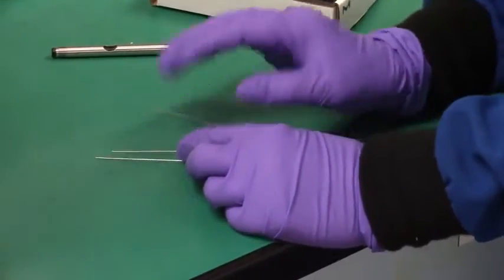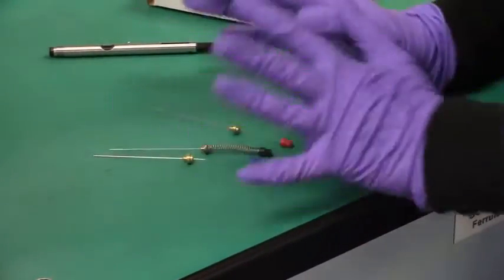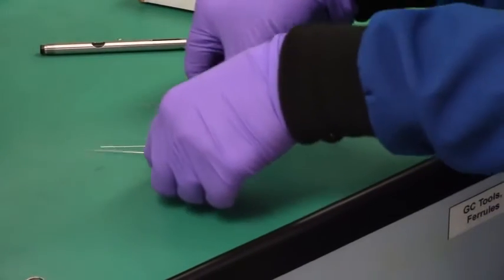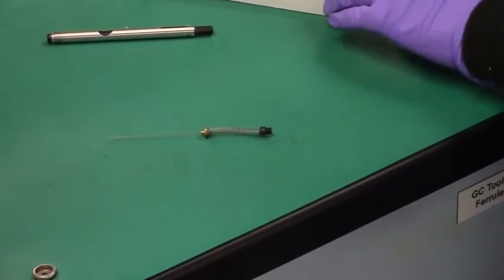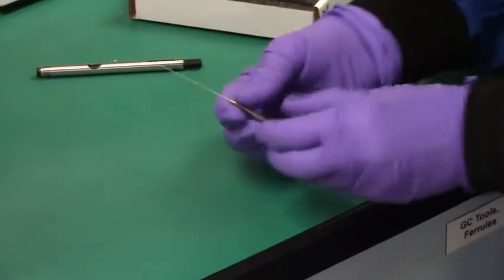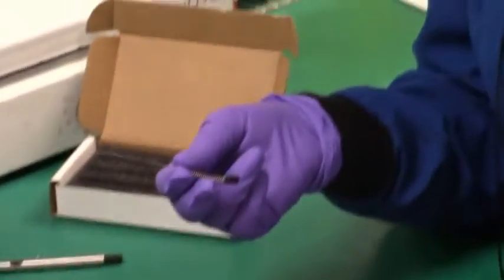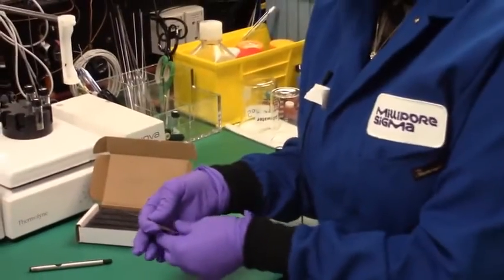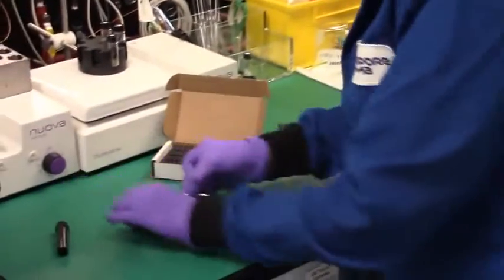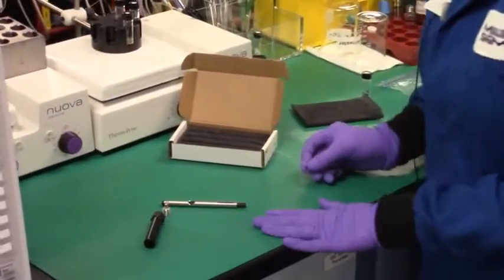Now for today, I'm not going to get into a big discussion of what kind of coating to choose for what, because we don't have enough time for that. But for what we're going to do for sampling terpenes out of the headspace over hemp, I'm going to use something called a carboxen fiber. Okay, this is a very retentive fiber, and it's very good for very volatile analytes. So I'm going to install it in my SPME holder, which I have disassembled here.